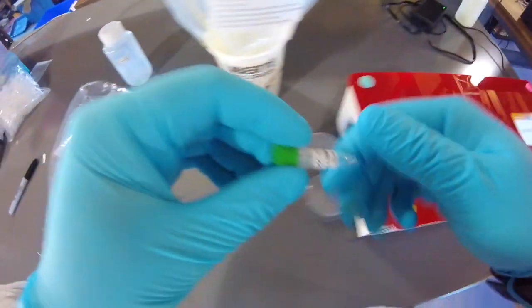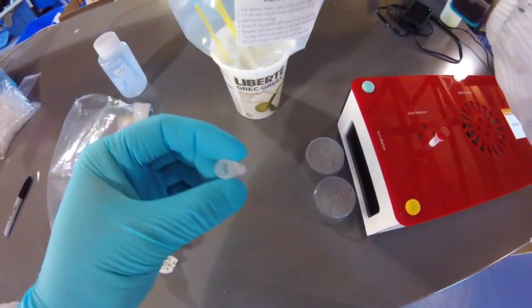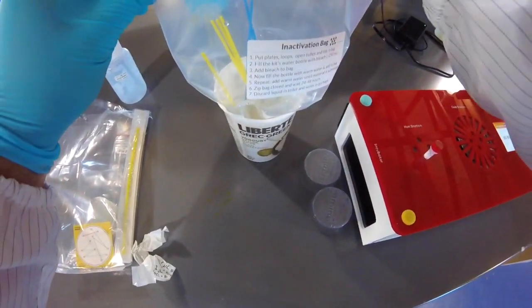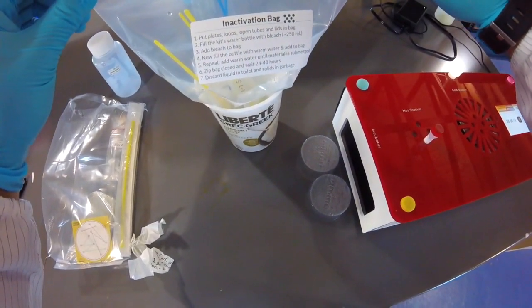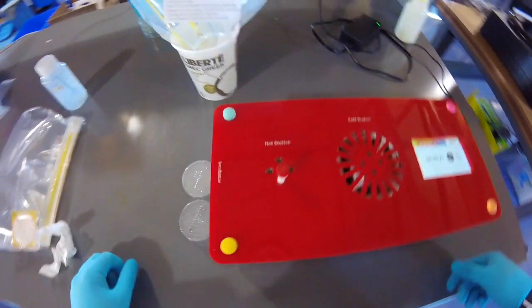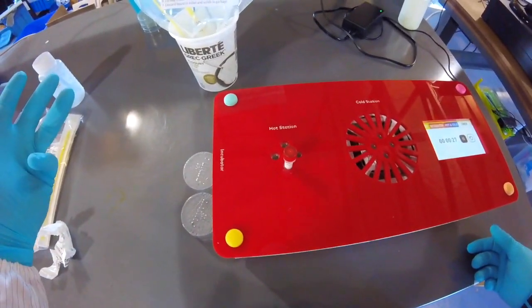And yeah, that's pretty much it. I'm going to put the recovery media tube in the inactivation bag. I'm going to close my inactivation bag because we now have some Petri dishes in there and we don't want to promote any sort of possible growth of contaminants floating around in the air, right?